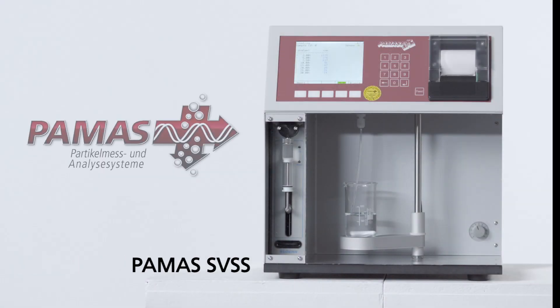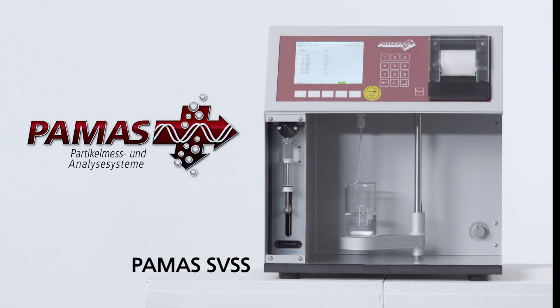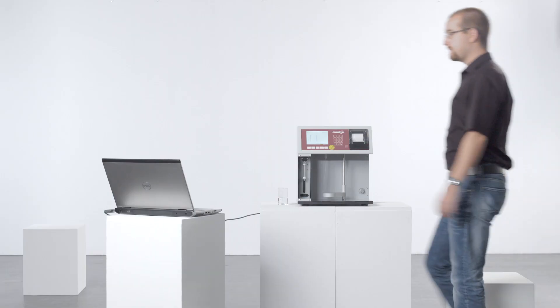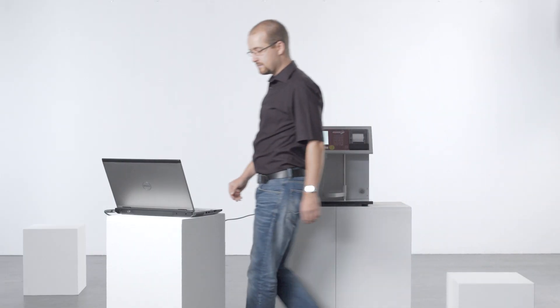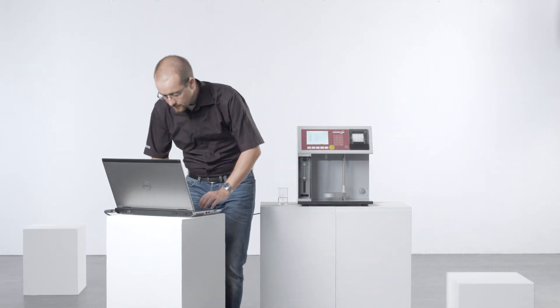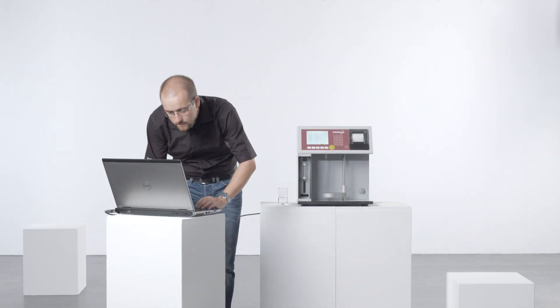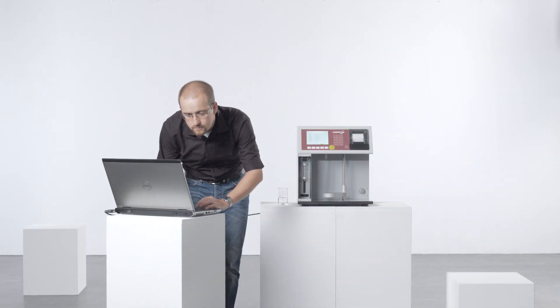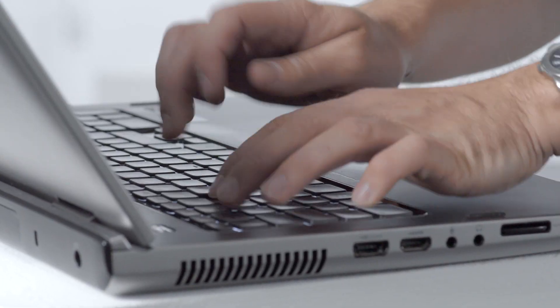The PAMAS SVSS Particle Analyzing System. A reliable and highly accurate particle counter specifically designed for pharmaceutical applications and the water industry.